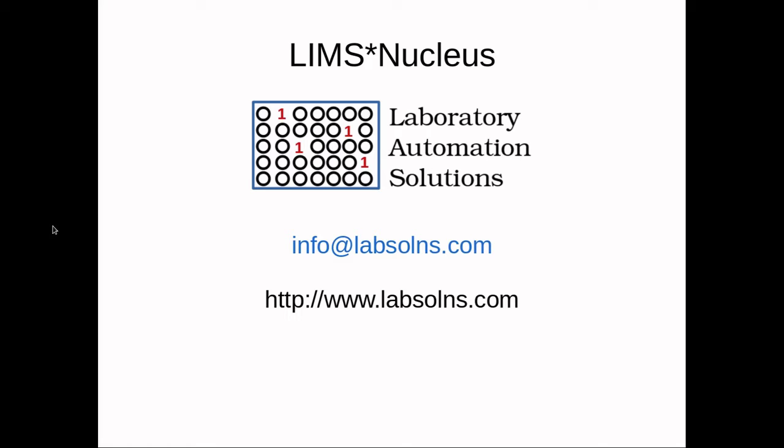LIMS Nucleus by Laboratory Automation Solutions. In this video, we'll learn how to navigate the LIMS Nucleus interface.